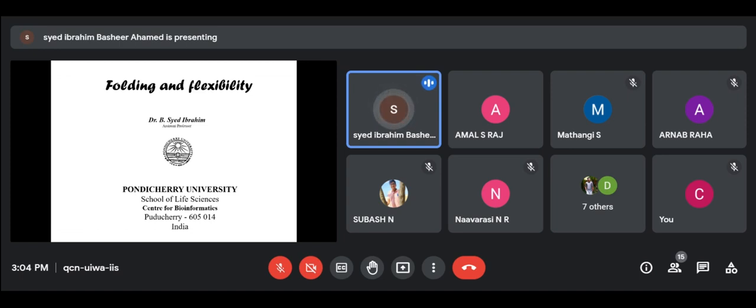But the thing is, we don't have a virtual lab, right? So we are conducting an online lab only. What I'm saying is, whatever we have to do in the wet lab, I will do as a concept explanation. What is the UV, what are you going to do in the UV experiment, I will explain conceptually. Based on that, I will conduct the test. Whatever you have to do online, I will also give you a demo, and within this we have to conduct the exam.